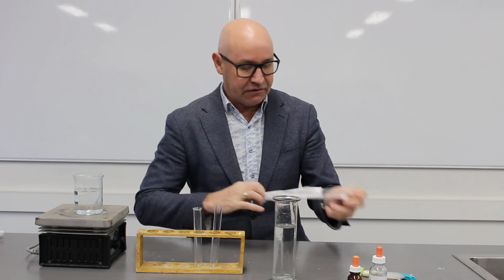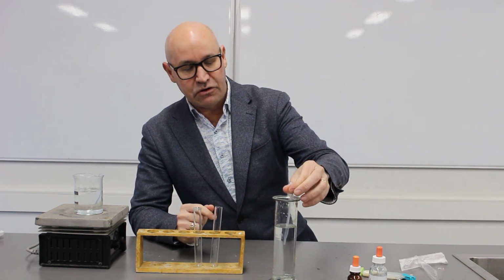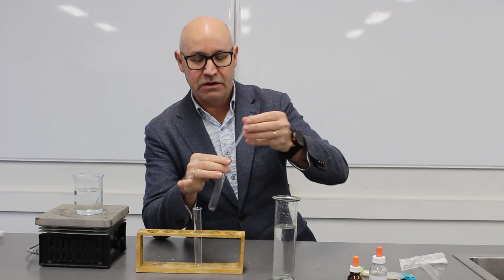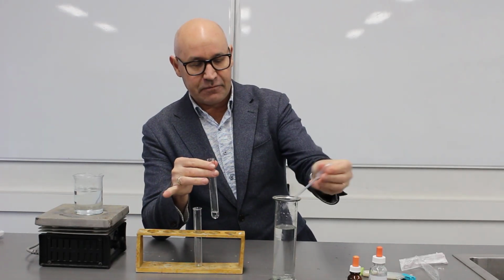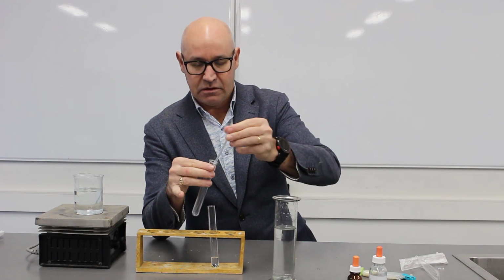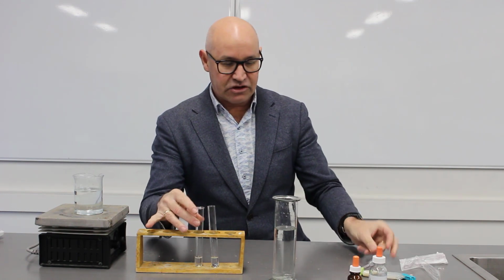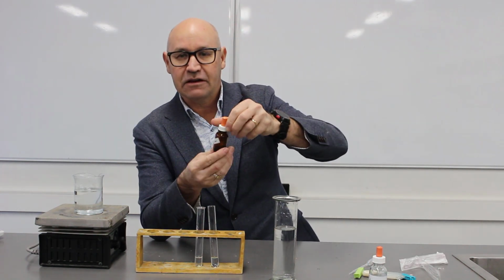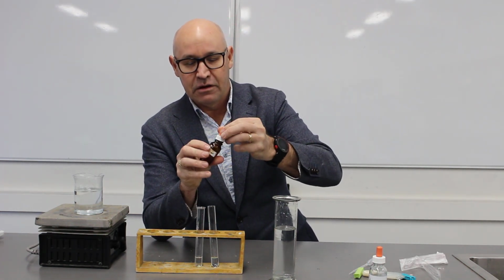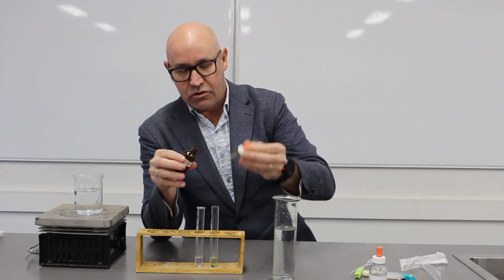Okay, so starch test and Benedict's test. So we'll use the transfer pipette to put some liquid in our test tubes. And we'll do the starch test first of all. Okay, so that's for the iodine. Now, I'll just go one more.